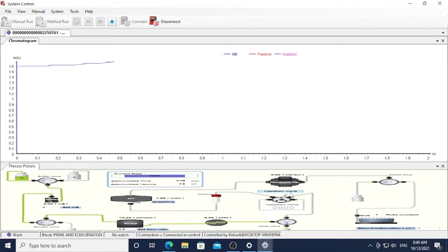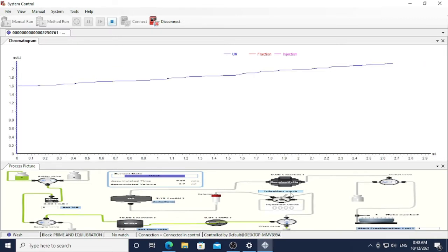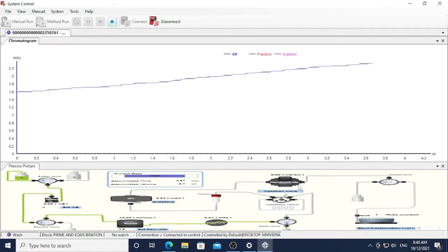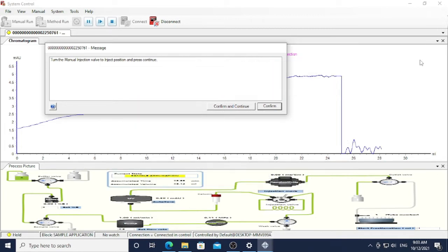This step takes around 15 to 20 minutes, so you have to be patient and wait until the column washing finishes. After that, you can start injecting your sample. In my case, after around 25 minutes, a notification sound will come out.